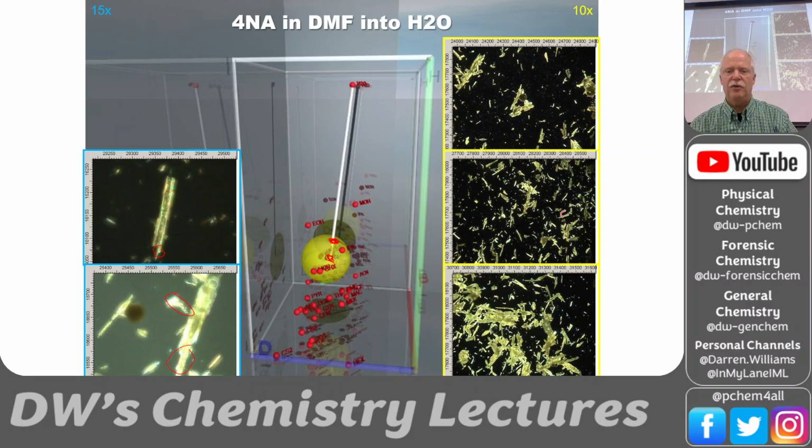This is also for microscopists. This is an embarrassing slide because I'm not a microscopist yet, still working. I don't have good dispersion of these crystals. So there's lots of overlapped crystals, and that's the thing that makes this slide really bad. I'm using cross polarizers, so that's why the background is black. The polarizers are crossed so that light that doesn't go through a particle is blocked. Light that goes through the particle is rotated, and then I can see it through the analyzer polarizer.